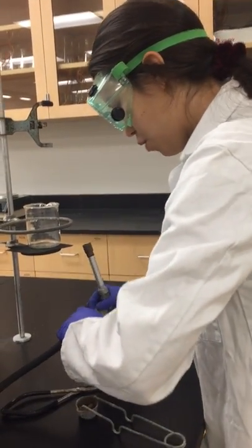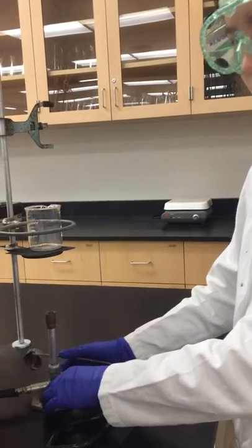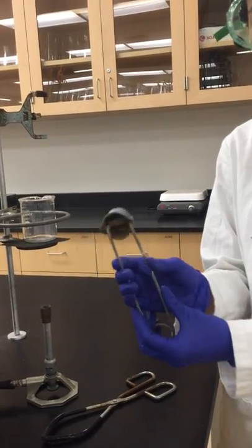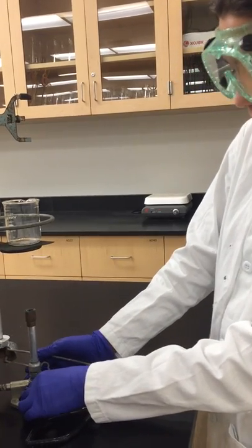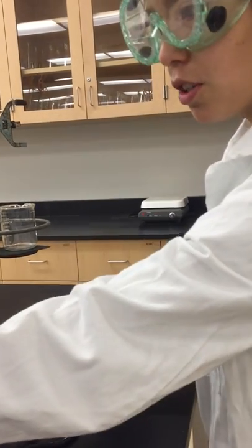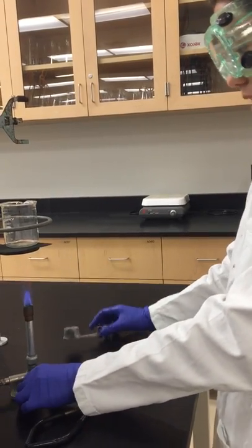And make sure there are no leaks. And so we're going to make sure that the striker produces a spark, which it does, and open up the gas supply valve just a little bit, turn on the gas, and light it.